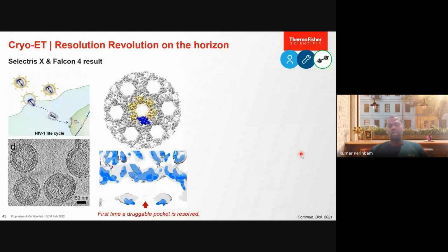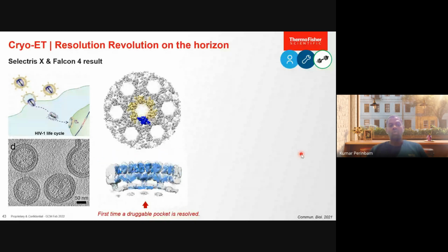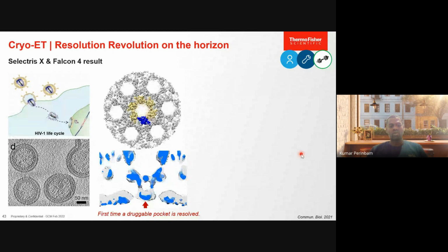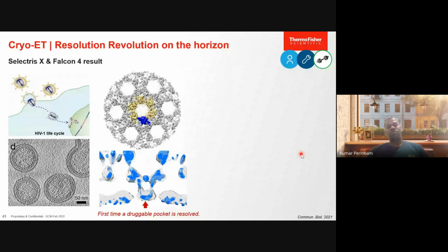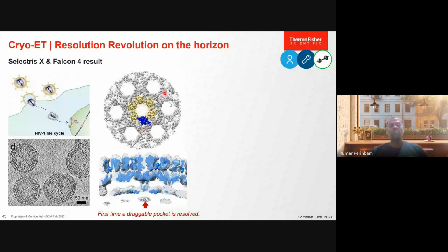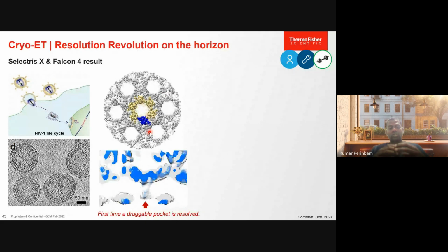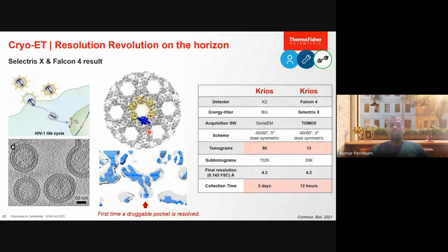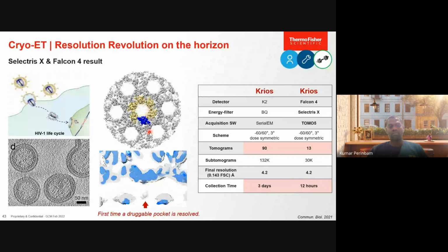So when we develop a drug, you can actually see how the drug interacts with the protein molecule or the biomolecules. While it is interacting, what kind of impact it creates on the whole virus or a bacteria can be studied at a single event, which is very important for most of the biologists.